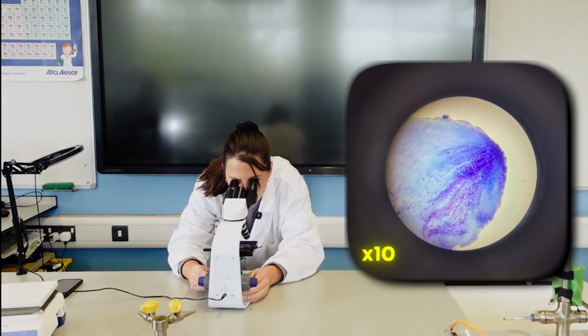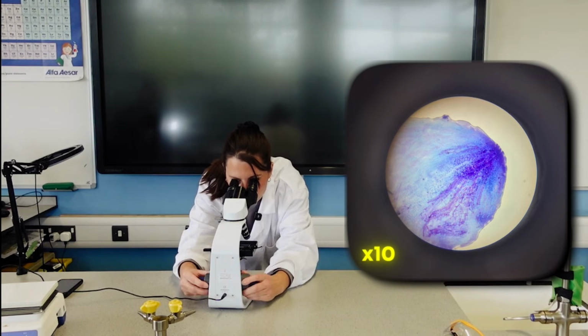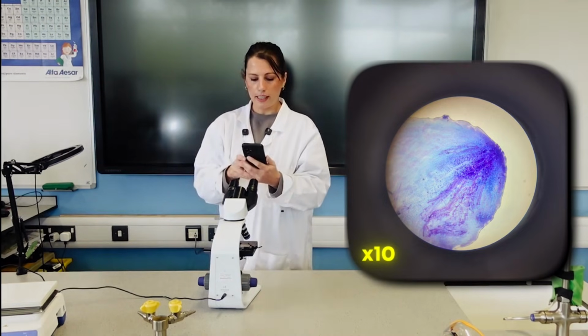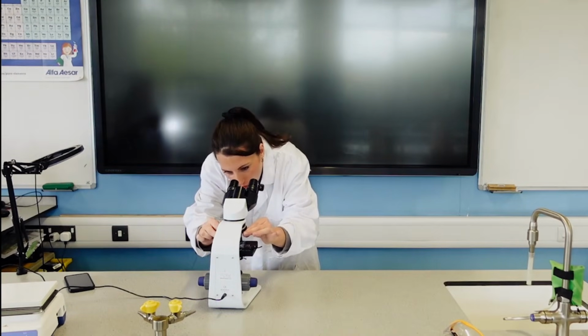So I can still see, but I'm just going to slightly change the position so I can see a section where I think hopefully we'll get some good cells to see. So again, I'll just show you what I was looking at. We're going to move up to a high magnification this time, times 40.